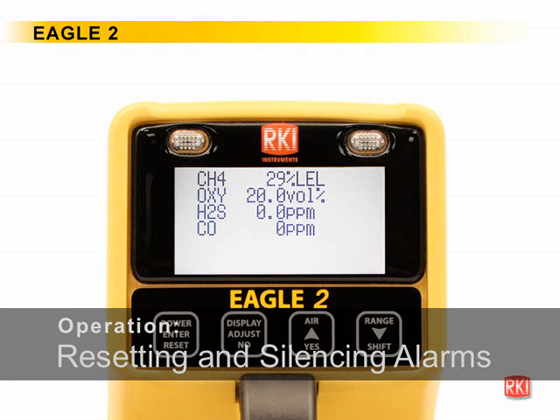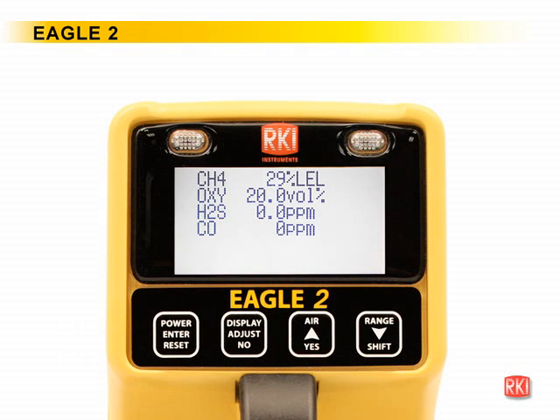You can set the Eagle 2's gas alarms as latching or self-resetting. Self-resetting alarms automatically shut off and reset when the gas reading falls below the alarm setting. You cannot reset self-resetting alarms with the power enter reset button. You can set self-resetting alarms with or without the alarm silence feature.